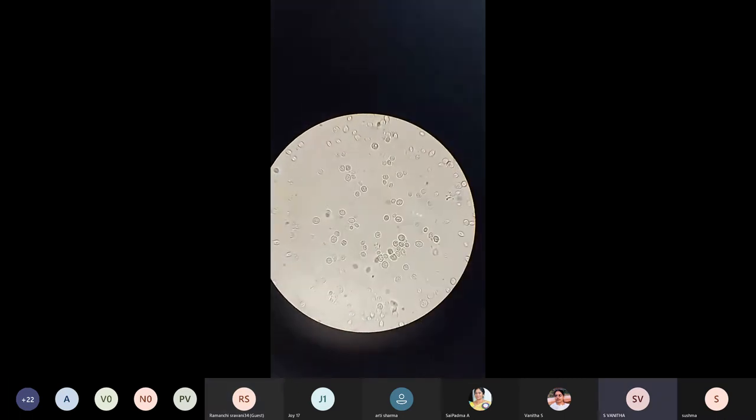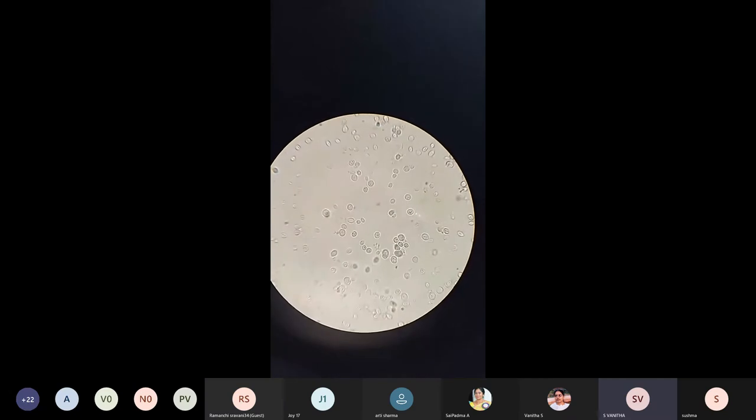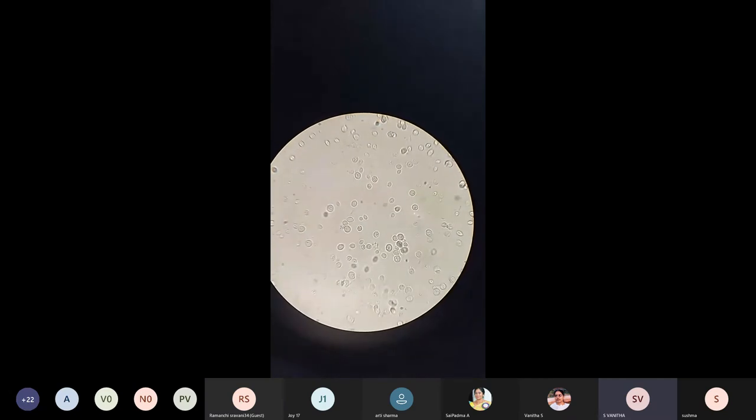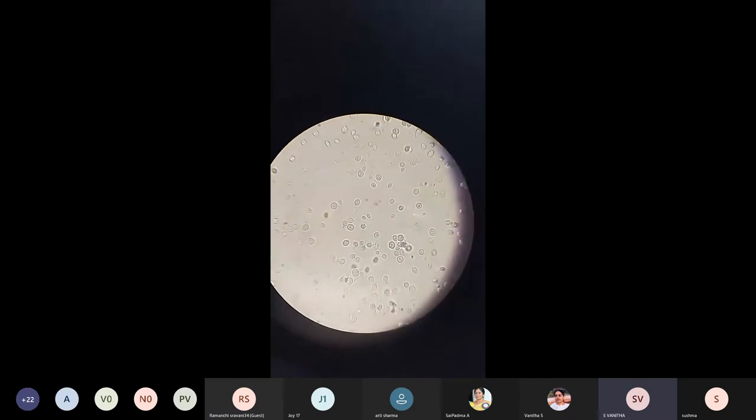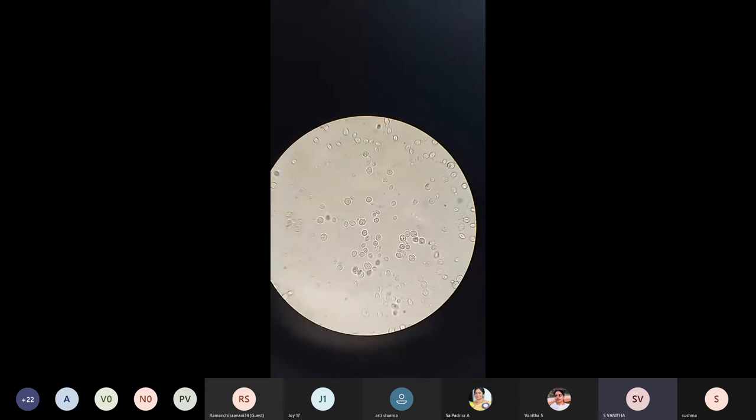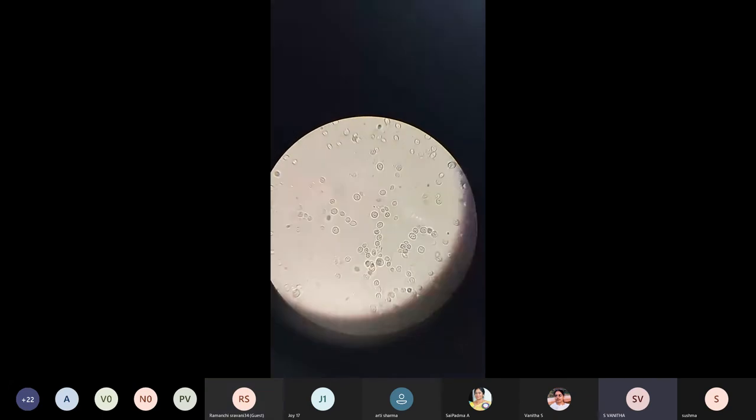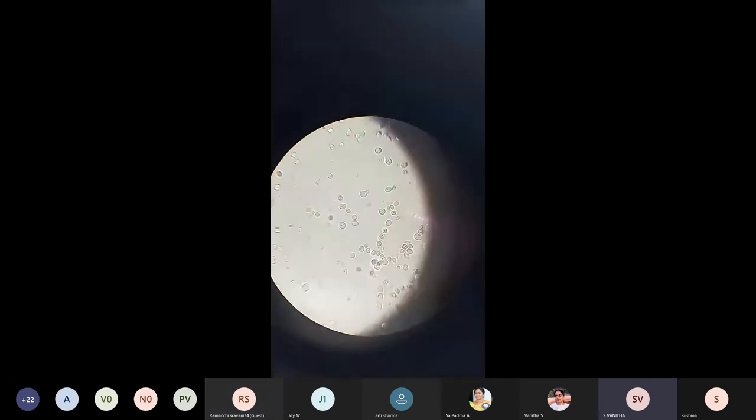I will capture some good pictures and I will post it to you for record purposes. So, these are three microscopes for observation of the samples.